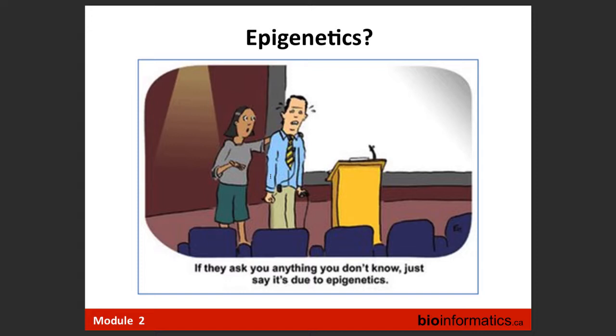Yes, please. A general question. You mentioned previously that you can't compare two ChIP-seq datasets because you don't know the percentage of enrichment over input. Is it common in the field to actually publish or report that number?